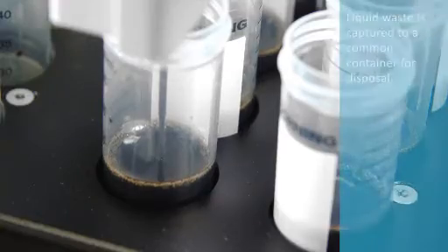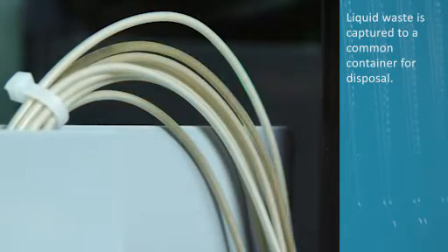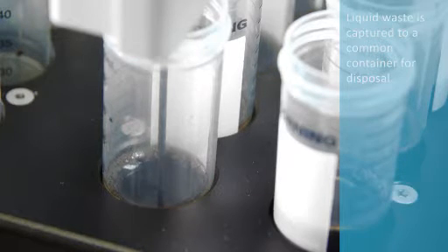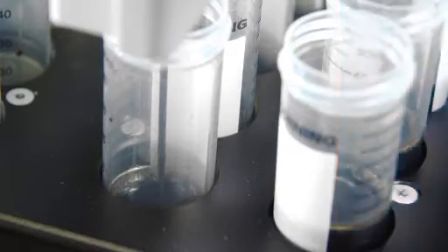Waste is rapidly aspirated using an eight-channel vacuum manifold. Each channel is independently controlled and efficiently removes the liquid waste to a common container for disposal.